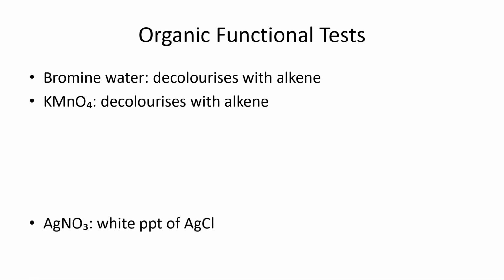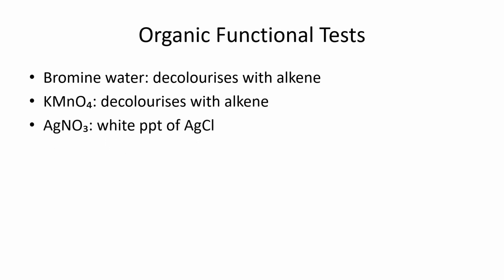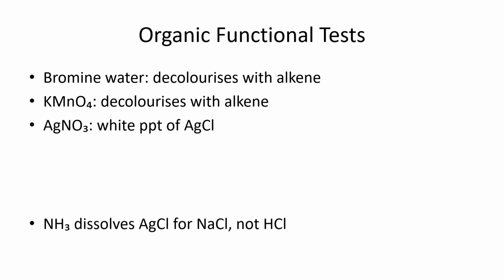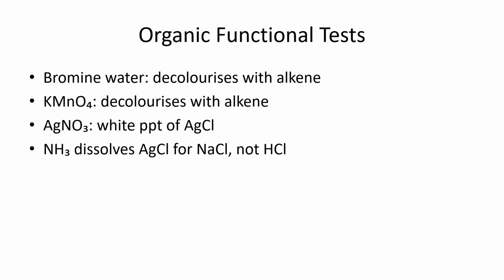To differentiate hydrogen chloride from sodium chloride, you could test with silver nitrate. In the presence of HCl, a white precipitate of silver chloride forms instantly. With NaCl, this also happens, but adding ammonia will dissolve NaCl's silver chloride precipitate, helping to tell them apart. Additionally, exposing hydrogen chloride gas to moist blue litmus turns it red, indicating its acidic nature.